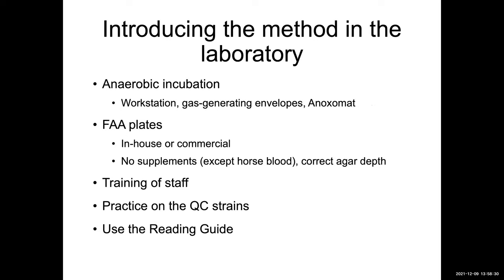Yes, we have that. So for the field trial phase one, where the 16 laboratories tested the same 35 isolates, we also looked specifically into each of the isolates. So Bacteroides isolate one, what was the reproducibility and variability for piptazo, for meropenem, for clindamycin, and for metronidazole. So yes, we have that data, and usually it looks really good, both for susceptible wild type isolates and for those that are resistant.